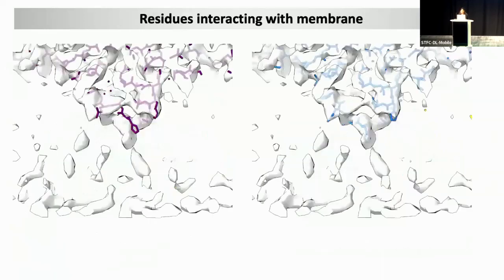The other thing I wanted to show you is that now we have the resolution, and we really trust our density a lot better, and we can do some modeling. This is just to show you that we fit the AlphaFold 2 models, and they fit really well, but there are some differences.